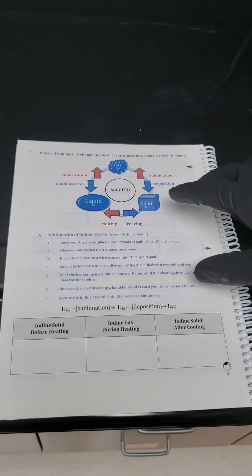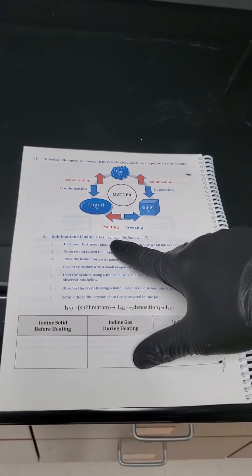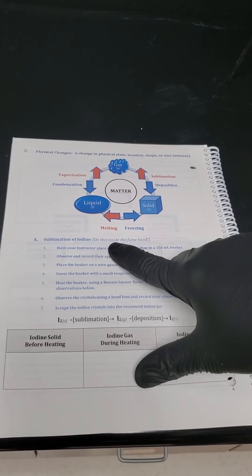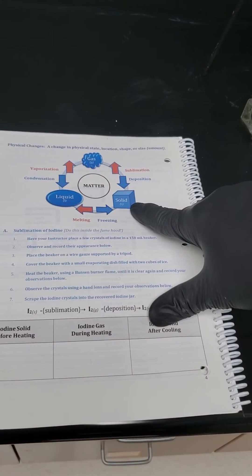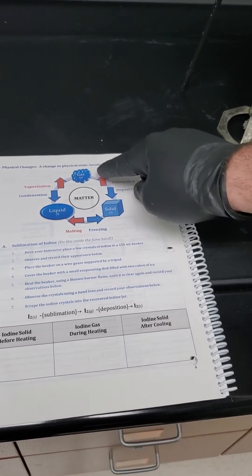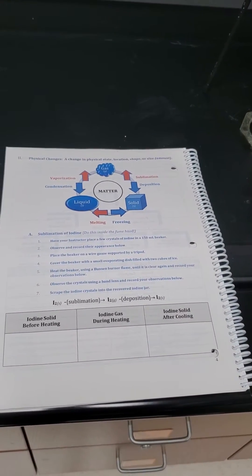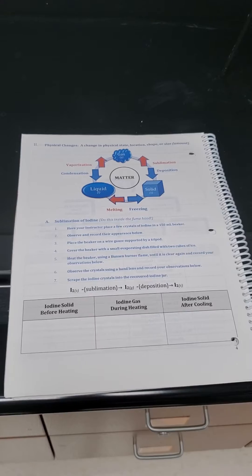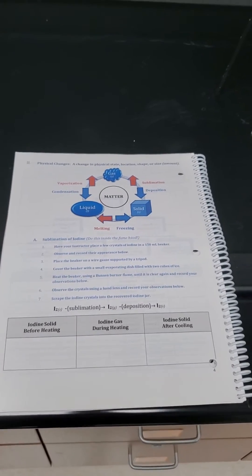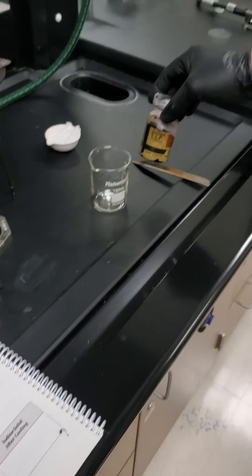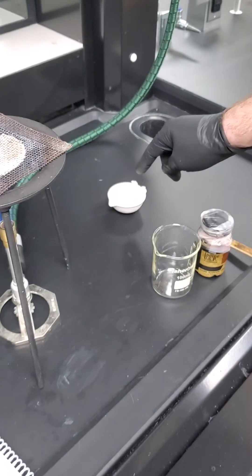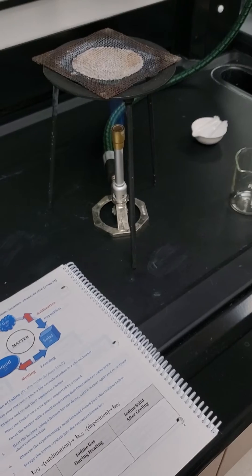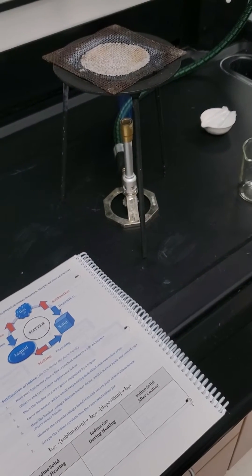So our first example today will be sublimation of iodine. We're going to do this inside the fume hood because of the vapors that are produced. It smells much like a hospital. What we're going to notice pretty quickly though is iodine that we're going to find is a solid. And when you heat it up, it's going to skip the liquid phase and go straight to a gas through a process called sublimation. And because that's reversible through deposition, that's a great example for a physical change. And it's our only physical change of this lab to show. So in order for this to work, we're going to need some iodine. And we're going to need our beaker. We're going to need an evaporating dish full of ice as a lid. And then we have our Bunsen burner in order to heat it up.